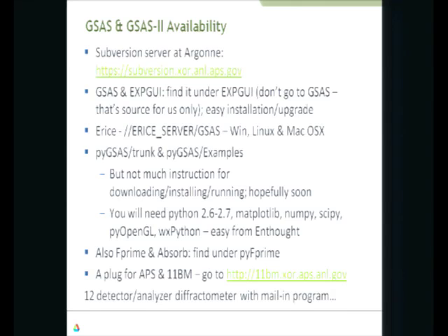And what F-Prime does, people may be familiar with the old F-Prime programs used for calculating where the real and imaginary part edges are. It's useful. It's used a lot at synchrotrons. Well, this is a new updated version of it that displays the scattering factors, and you can actually change the energy and watch the scattering factors move relative to each other because of resonant scattering.